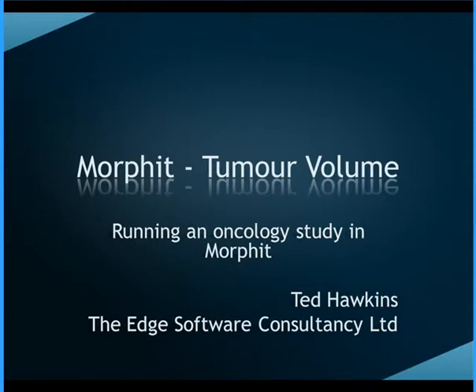My name's Ted Hawkins and I'm from the Edge Software Consultancy, and today I want to demonstrate how we can use Morphit to run an oncology study, specifically a tumour volume study.